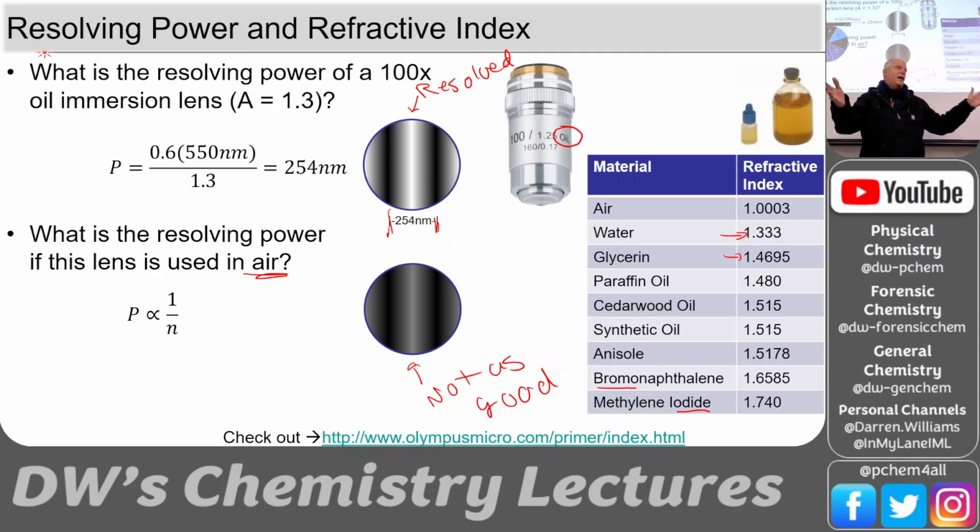A lot of light is scattered, and very little, like a 1 in a billion chance, you might have a Raman transition. So Raman is really, really small, but it's the same phenomenon. Light interacting with the electron cloud, and either inelastic scattering, which is Raman, elastic scattering, which is Rayleigh, or continuing in the same path, which is refractive index. Now, the fun thing about this, we just said that light is bent. It bends when it hits a material.